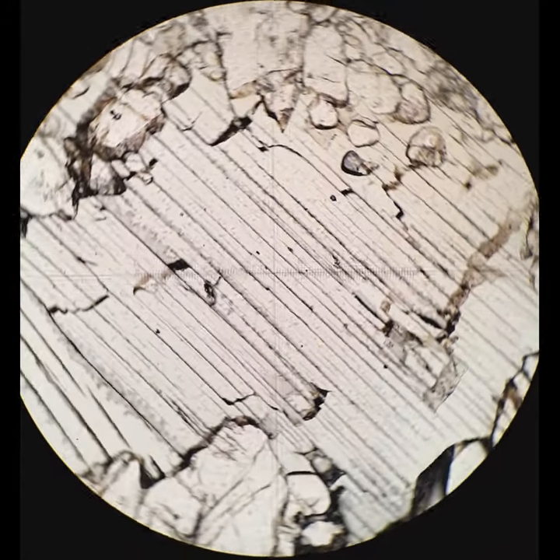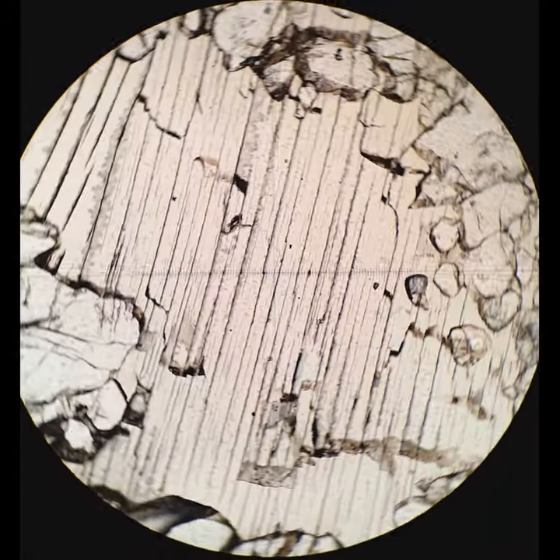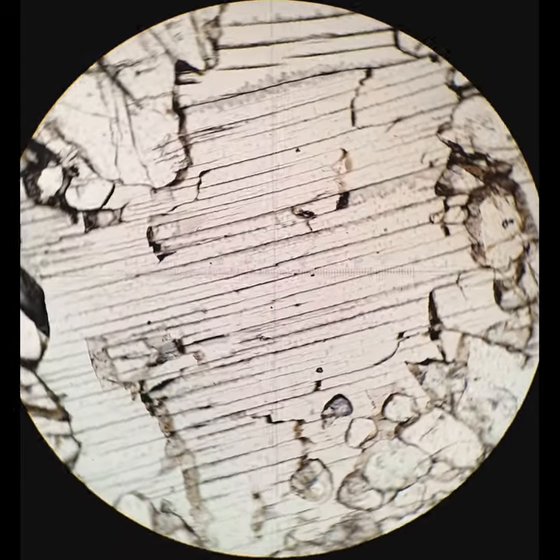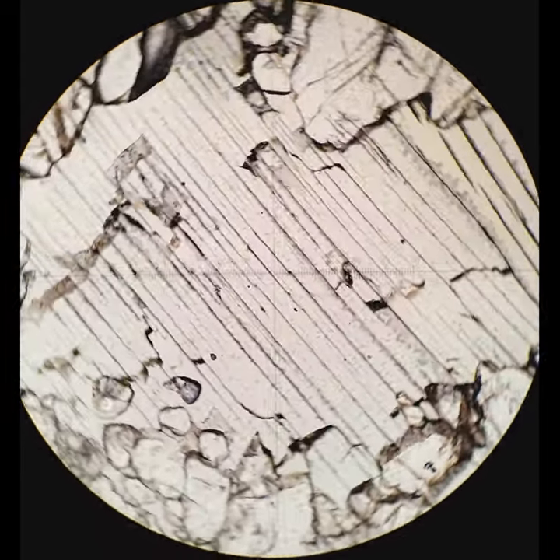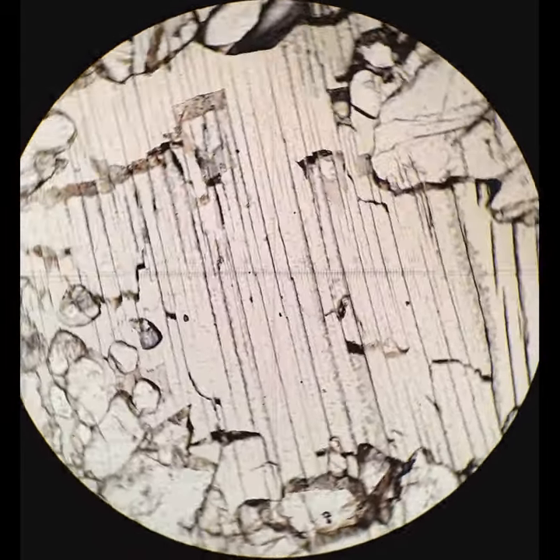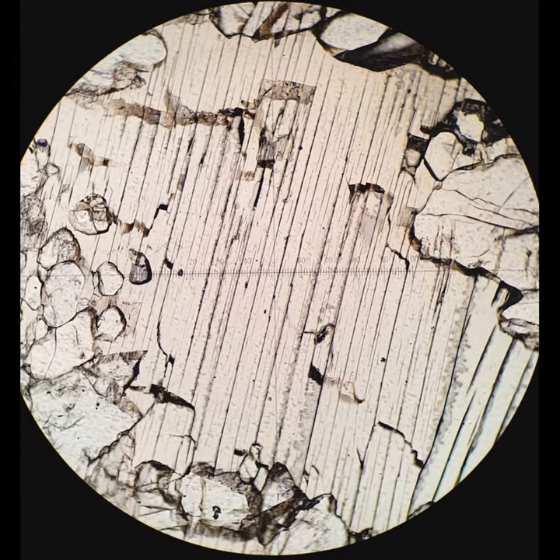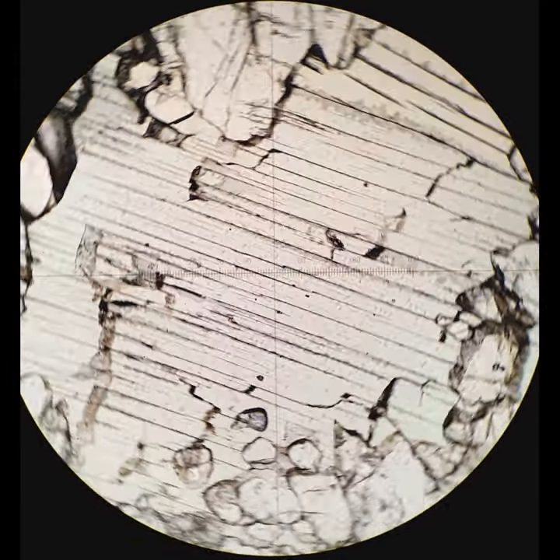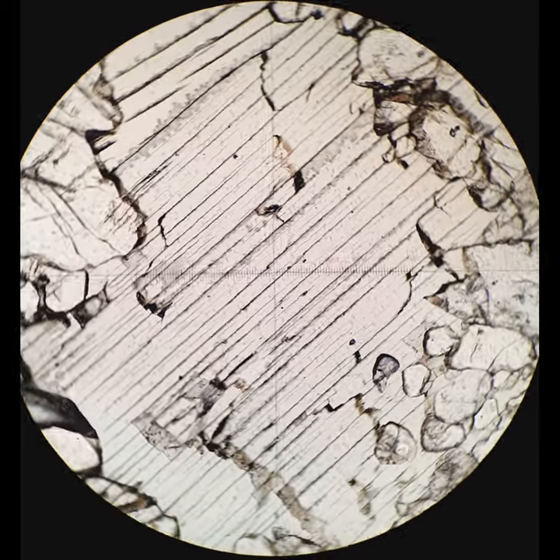Pleochroism can be pretty subtle. This clintonite crystal, basically a calcium biotite, is sort of pinkish when the cleavage planes are running north-south, and a little more greenish when they're running east-west.